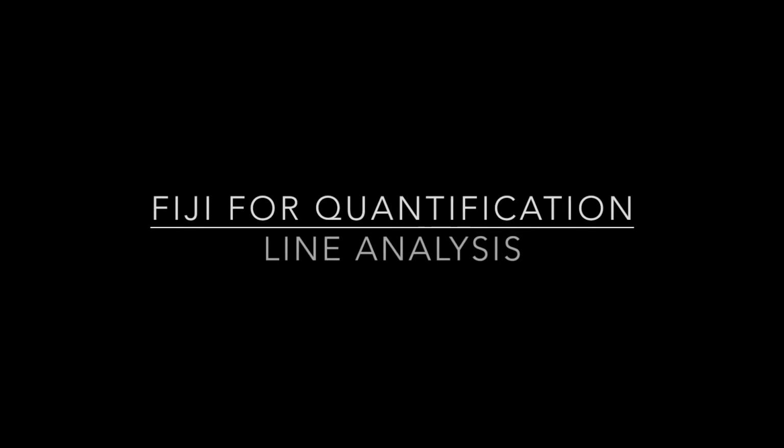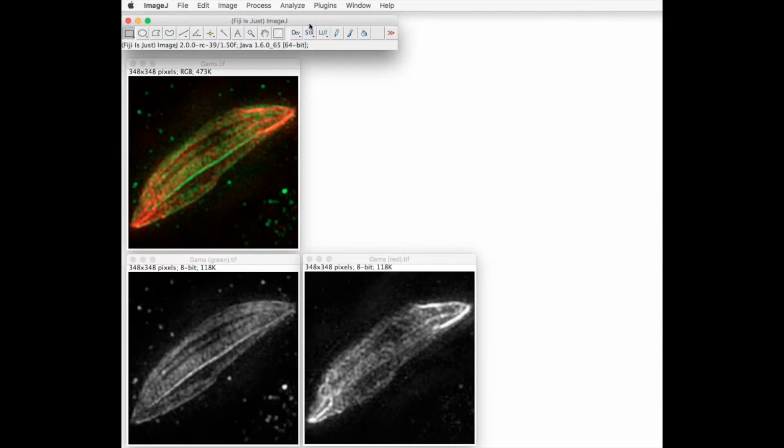This tutorial will take you through the steps for doing a line profile analysis. In this, we want to use the Line Region of Interest tool, and we're going to use segmented line. What we want to do is analyze the intensity of the two channels along this filament.